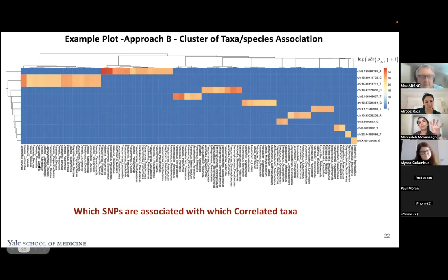That means they're all from the genus Devosia. But then Neisseria is also in there, and then Alcanivorax is also in there, and a couple of other ones. And they're all occurring at the same time. If you look at the Euclidean distance right here, they are separated. So that seems to be a specific community that is in there.